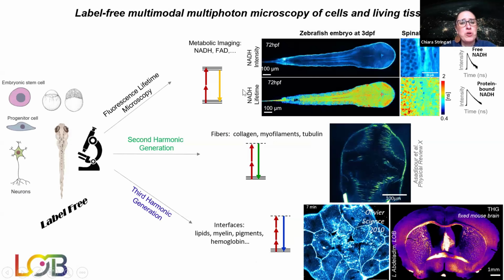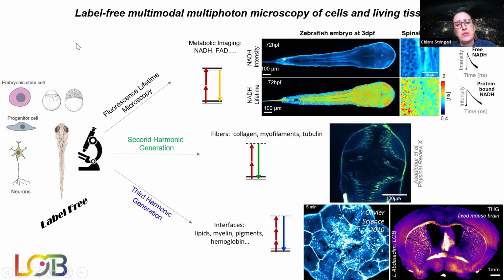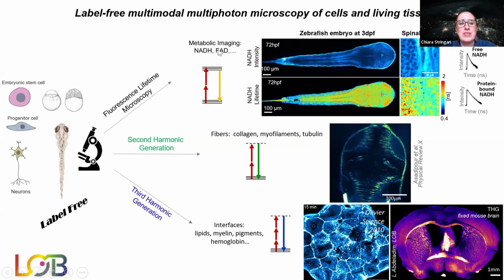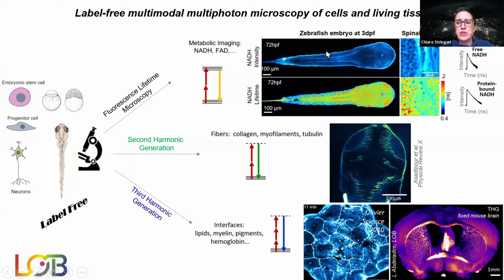What we also work on is combining different types of microscopy and nonlinear optical contrast for label-free functional imaging of tissues. So we are combining fluorescence lifetime microscopy and two-photon excitation of endogenous biomarkers. And this is the focus of today's talk.